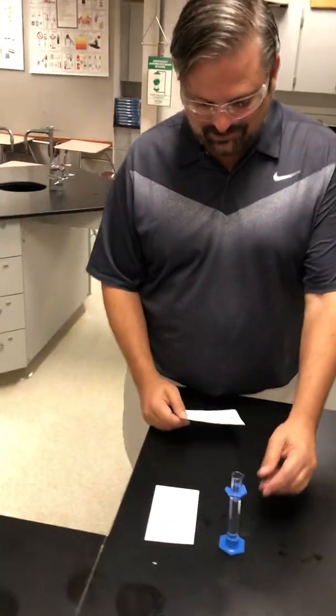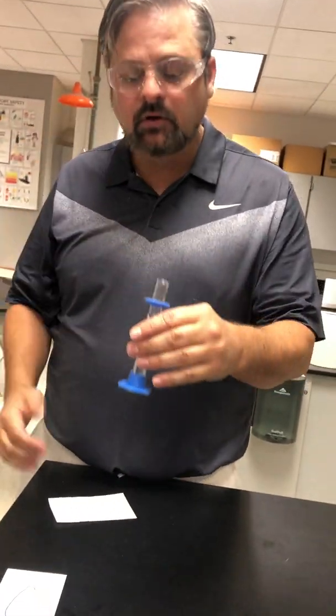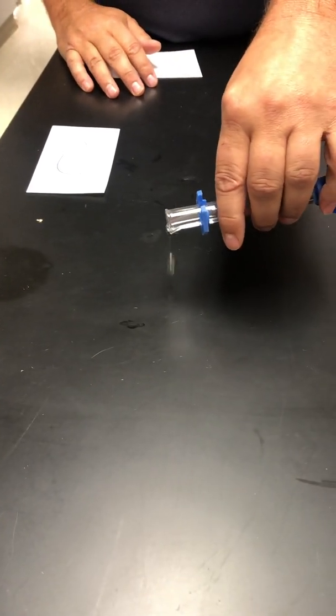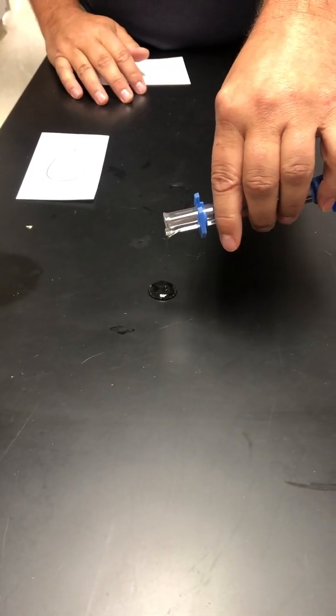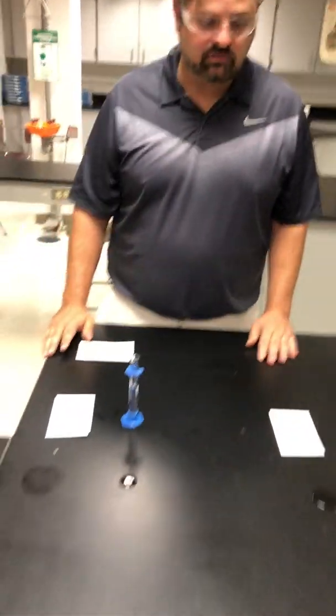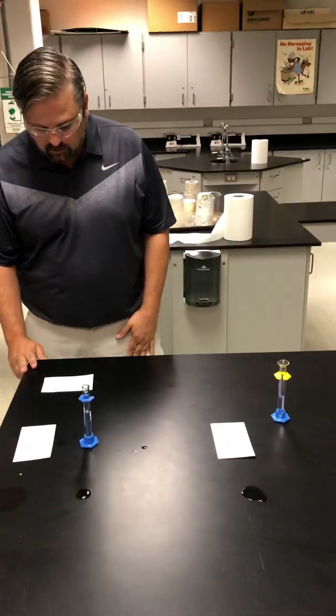All right, now let's check out substance C. So again, I'm going to waft, no odor. We'll pour a little bit out. Oh, this one pours much slower, so it's thick. So we would say that has a high viscosity, has a high resistance to flow.